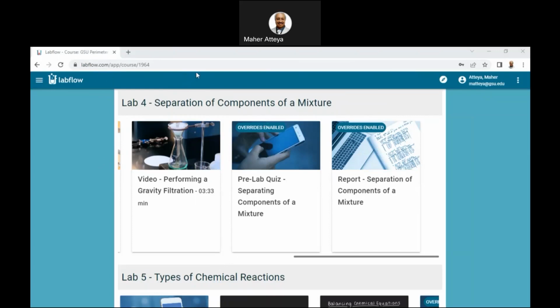So here it is: fill, no fill, and it's red, so no fill, and it has to be red. Okay, and the arrow will show us the importance of what is the, let me get to the arrow here.